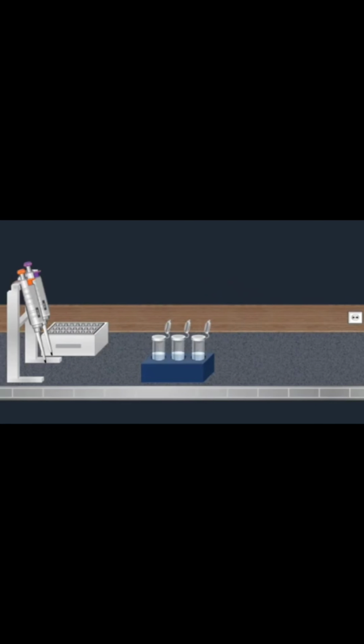The next step is the preparation of the DNA samples. A loading buffer is added to each sample. This buffer contains glycerol and a dye such as bromophenol blue. It is used to increase the sample's density, allowing it to sink into the gel, provides color, and makes monitoring of the separation progress simpler.